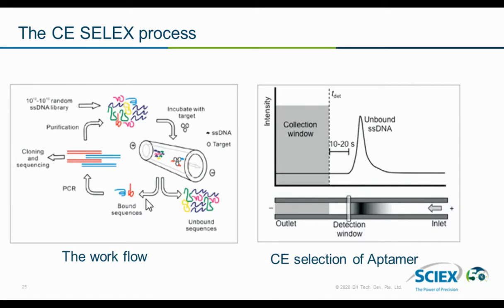The next slide is really around RNA aptamer manufacturing, and it's a quite clever way that CE can be used to help select and produce aptamers, RNA aptamer therapies. Here we're actually using CE as a fractionation device. So basically, we use CE to separate the aptamers, right?